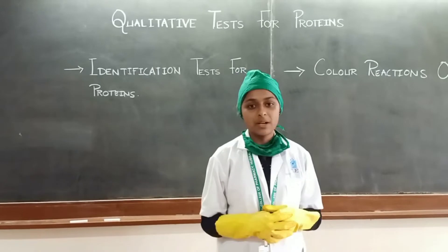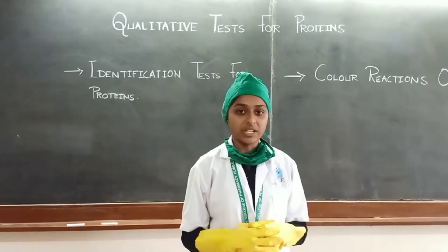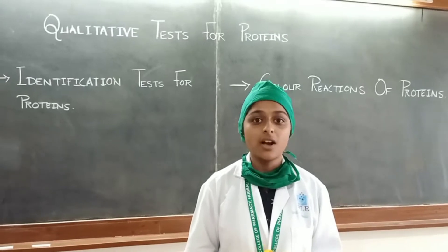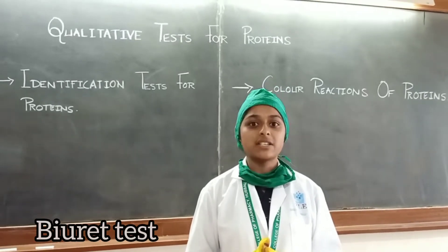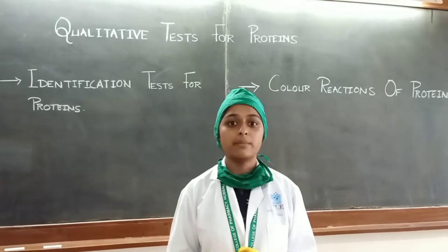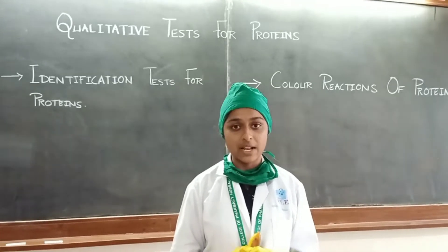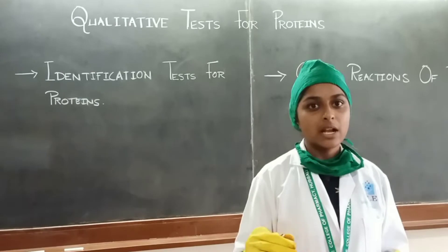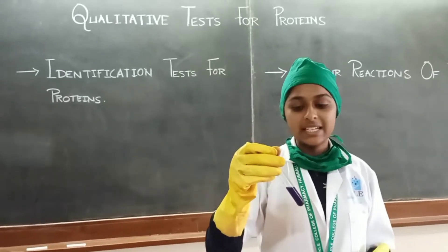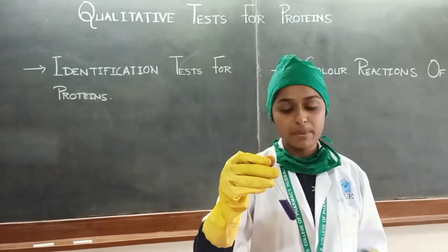Hello everyone, I am Archana. I am performing a qualitative test for proteins for a given unknown sample. First, the biuret test: 3 ml of sample solution plus 2 ml of NaOH plus 2 to 3 drops of CuSO4. Mix well. By performing it, appearance of a violet color indicates that proteins and peptides may be present.